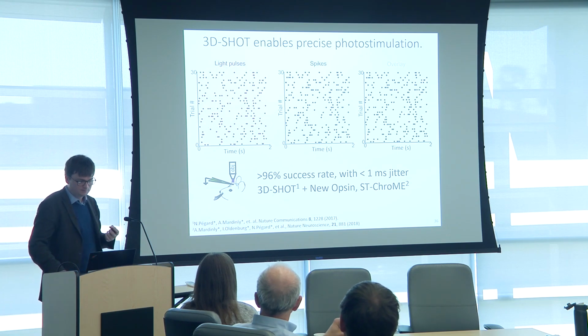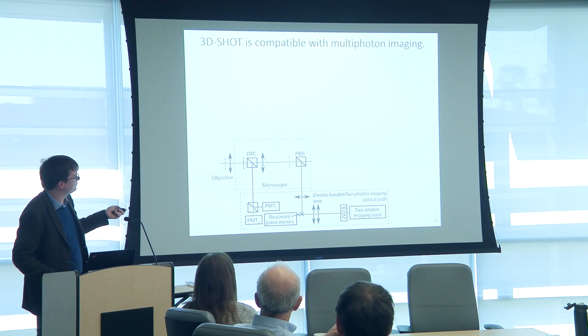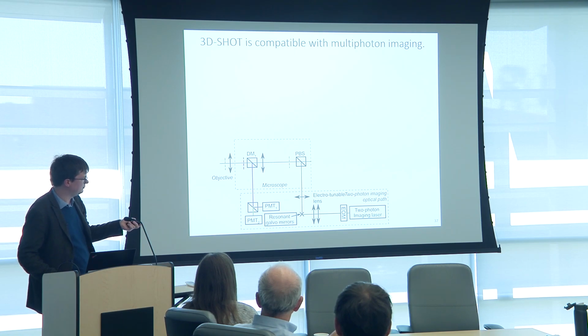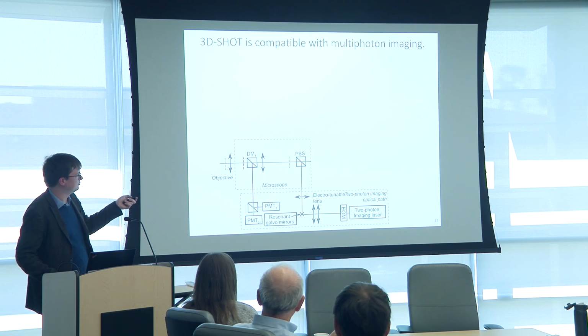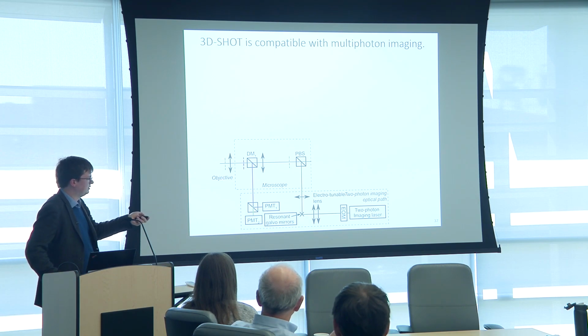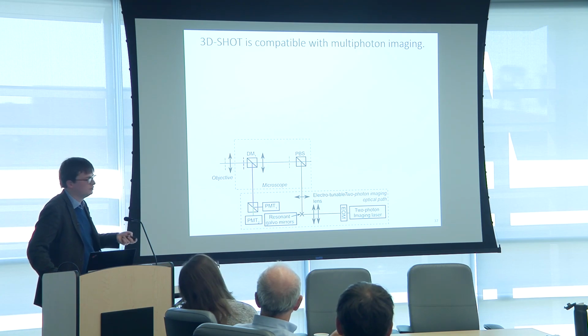So how do we implement this device? For instance, you take an imaging multiphoton laser. We've seen multiphoton imaging systems, about 2 of them today. 3? 2? I don't know, many. But 2-photon imaging with resonant galvo mirrors. You send that into your microscope system, so another 4F system right here, and you can collect your green and red channels, for instance, and use a polarizing beam splitter to merge 2 optical paths.